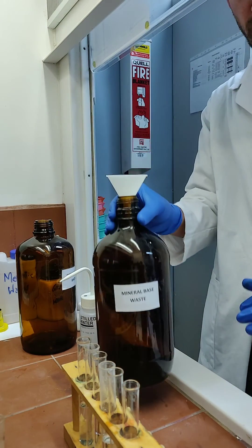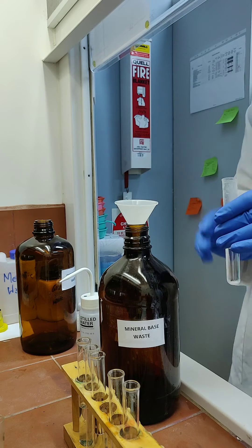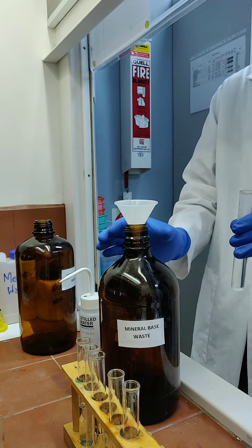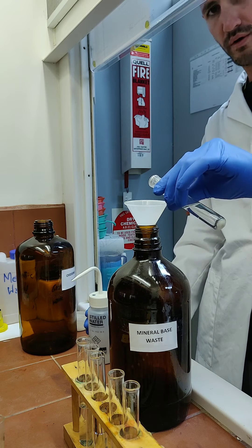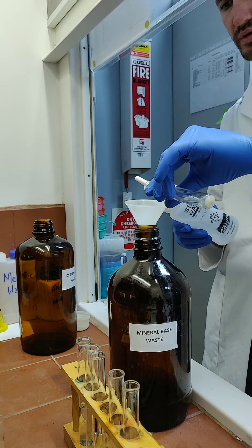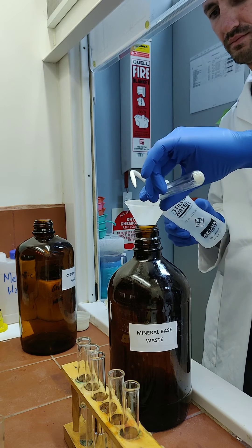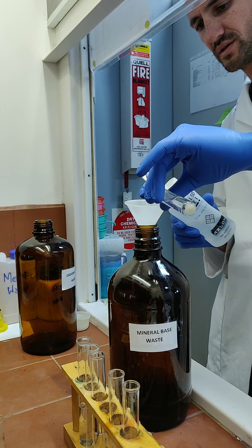Lastly, we'll dispose of the sodium hydroxide. Again, funnel in the appropriate waste bottle, pour it down the funnel, and use a little bit of water to rinse it down. Ensure that all the waste goes into the bottle, not down the sink.